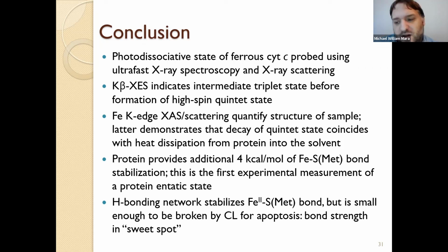Cytochrome c and myoglobin or hemoglobin are pretty much the workhorse proteins for these sorts of things, right? Because you have so much of it, they're simple and they're very robust. You can get away with the slower rep rate and the slower sampling. However, you probably do benefit from more difficult experiments or more elaborate proteins down the line.